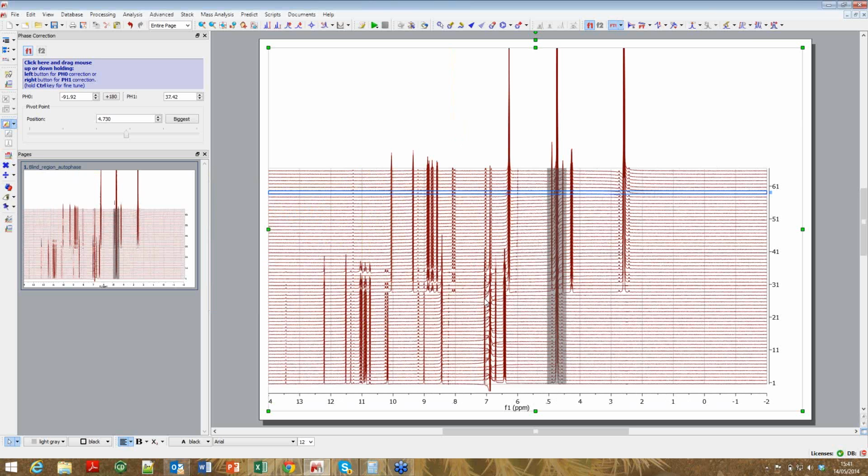I did want to say too that alignment is quite tricky, which is the point I was trying to make when you're extracting a multiplet that's moving. That's essentially an alignment issue, and alignment can be quite tricky.